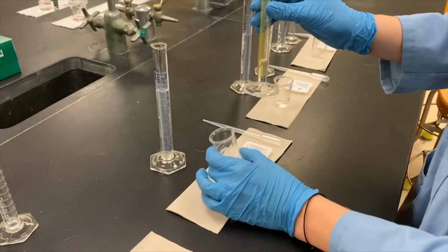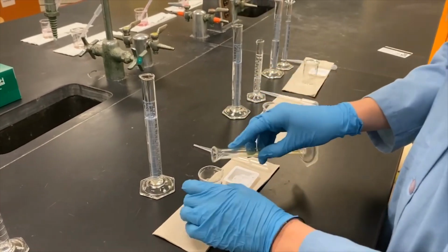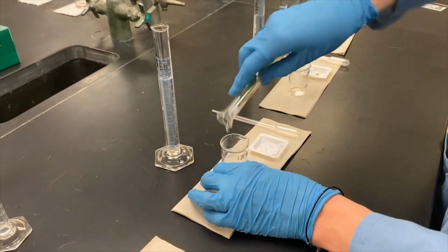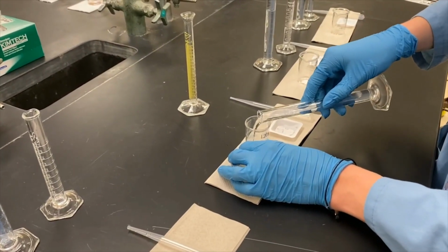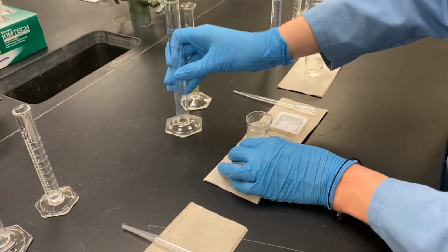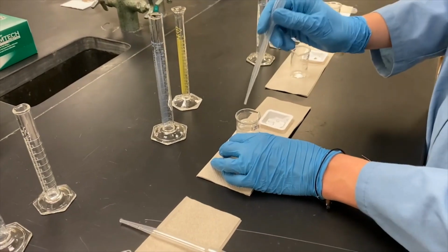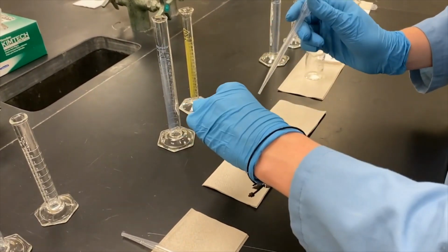See now, for our 1.20 ppm, we have a little bit more. We have 3 milliliters of our stock solution. And it makes sense that the higher concentration solutions would have more of the stock solution each time. And basically what happens is the more stock solution we have, the less water we put in to keep it at 25 milliliters each.